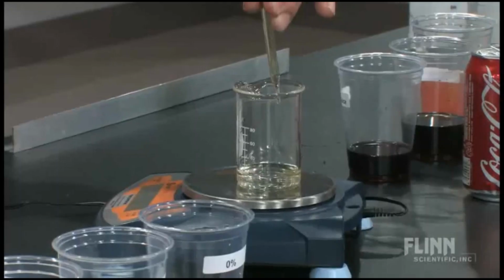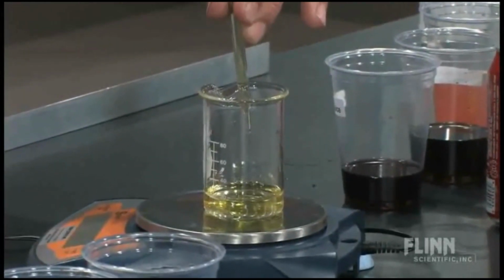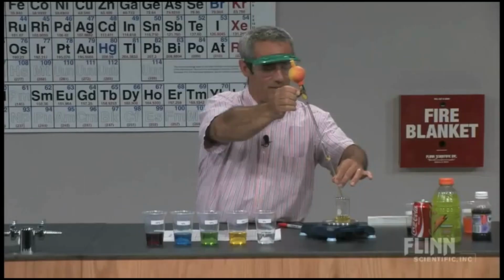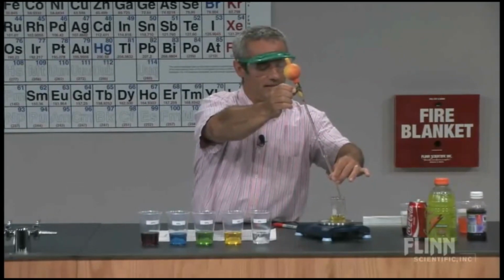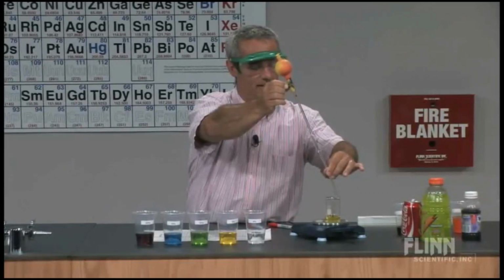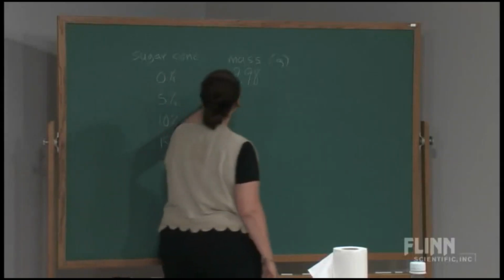Of course, it's a little old-fashioned, these pipettes. Now if they went to work in a lab, I don't think they'd necessarily be using these kind of pipettes. They've got these ones that are done automatically, electronic ones. But I'm now letting this 10 mils of 5% solution into the balance here. It was zeroed, so this is just telling me the mass of the added 5% with that little drop there. And we're looking at 10.15, okay, 10.15.